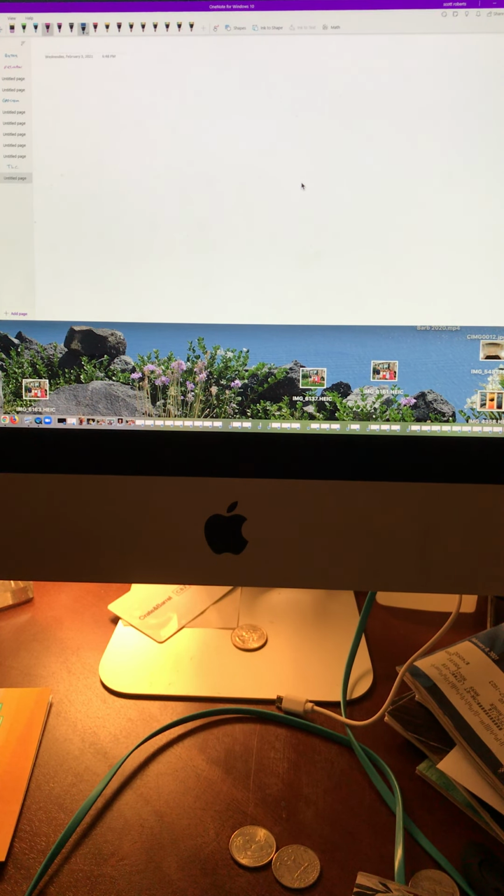There is one special TLC paper called what? Silica. And this violates all rules. The silica paper itself is philic. So it's like a glue trap. The silica paper is philic, so it traps philic things. So regardless of the solvent, it doesn't matter. So if you have a large RF, please know this because I test silica a lot because it's very commonly used. I promise you, if you only use silica in undergrad, it's not the only TLC out there. So don't believe everything you think you know. So if you have a very large RF on silica paper, what does that mean about you? Now you can tell me.